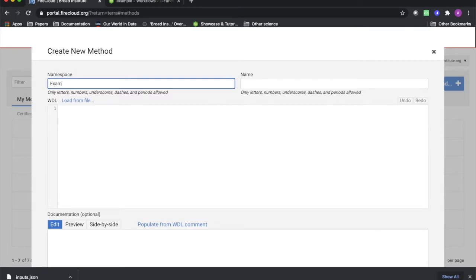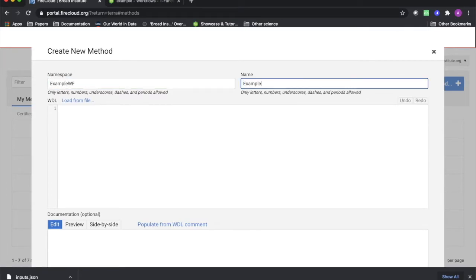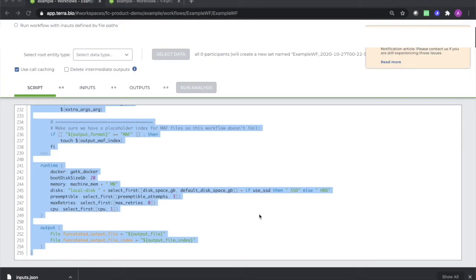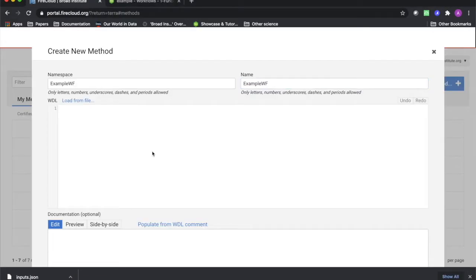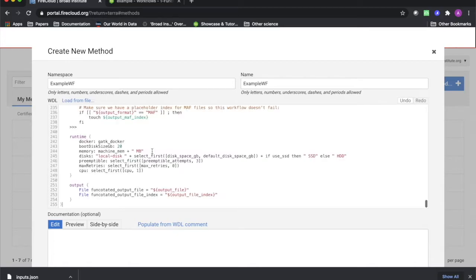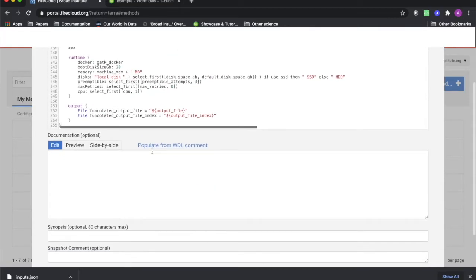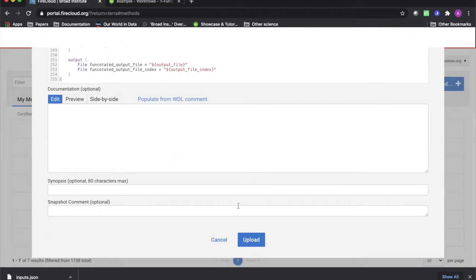I'm going to copy over the WDL script from the workflow that was already in the featured workspace. Now click Upload.